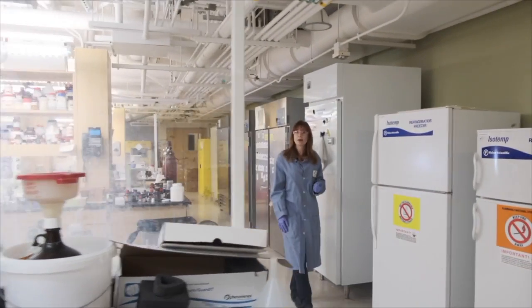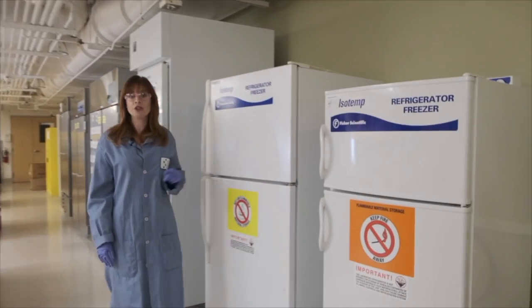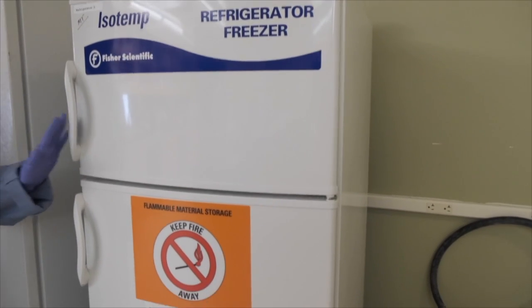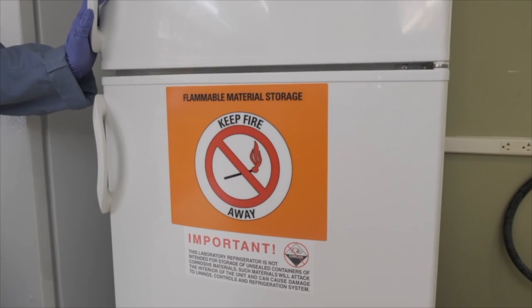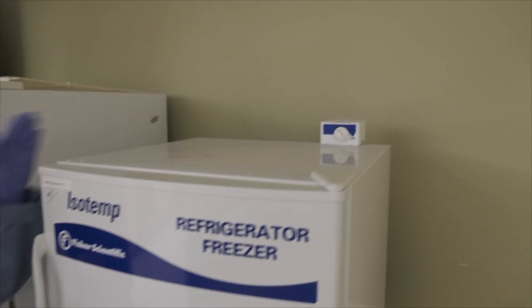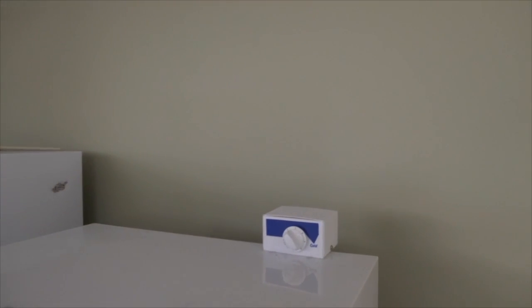You want to avoid storing flammable materials in a regular refrigerator or freezer. Make sure that you're storing them in an intrinsically safe refrigerator or freezer. One way you can tell is that the electrical components are located in a box on the outside.